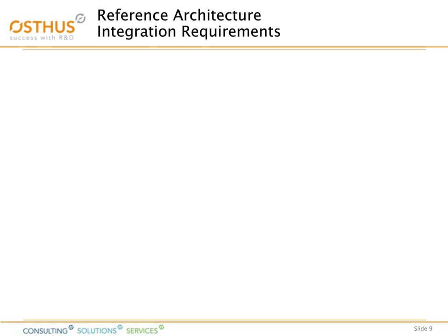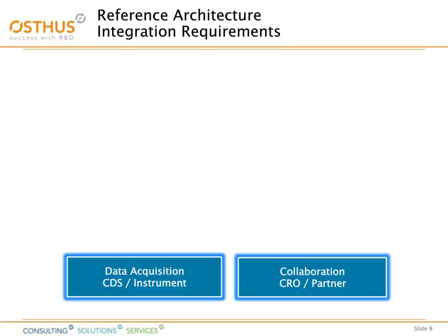We will show you a typical example of an integration scenario with some common issues encountered there. Most companies strive for information systems integrated with lab equipment and instruments. Data is normally automatically captured and transferred from the data acquisition instrumentation.